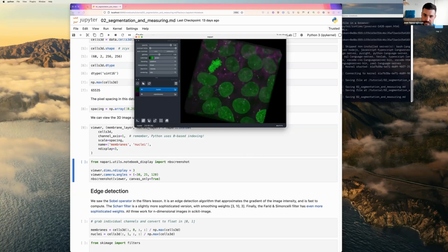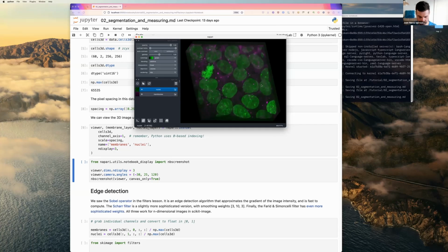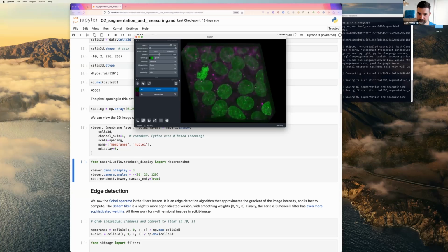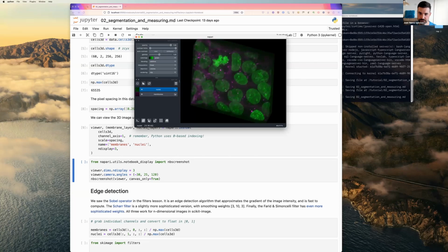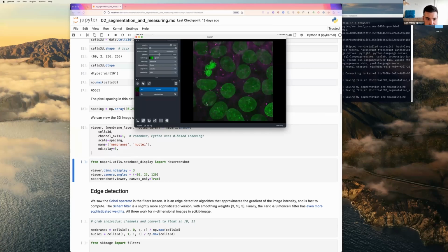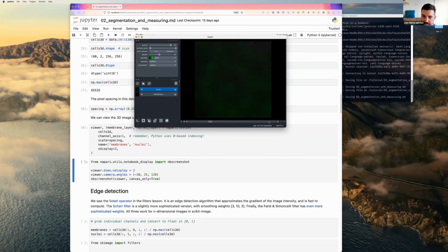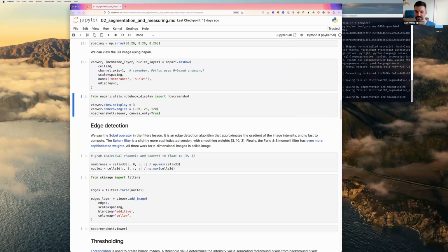And you can look at it in 3D and again, zoom in and zoom out with the scrolling. And if you want to pan in 3D, it's shift, click, drag, because otherwise by default, you're rotating with the click. And you can press home to reset the view. Oh, and you can always switch from 3D view to 2D view, and then you can look at all of the slices. You get a slider for the dimension that you've lost, and you can look at all of the slices. Okay, so just like we did edge detection in 2D, we can do edge detection in 3D.